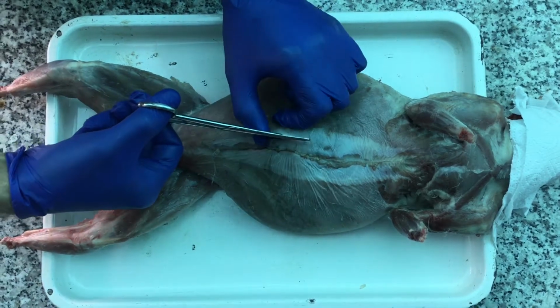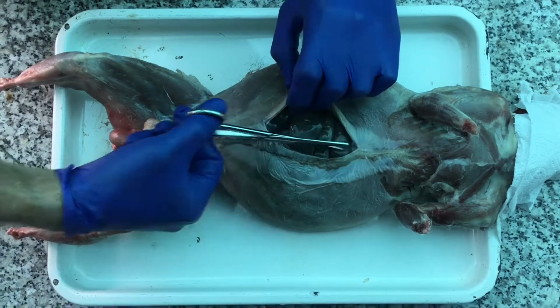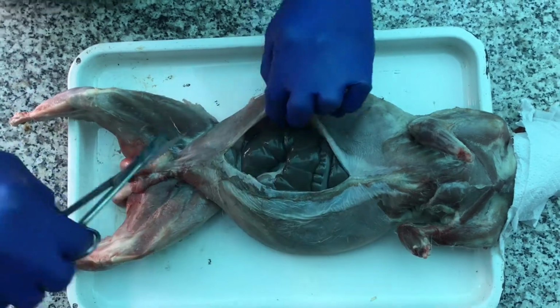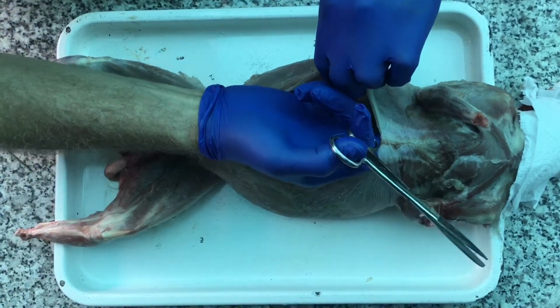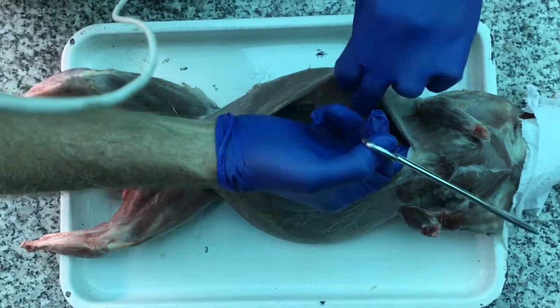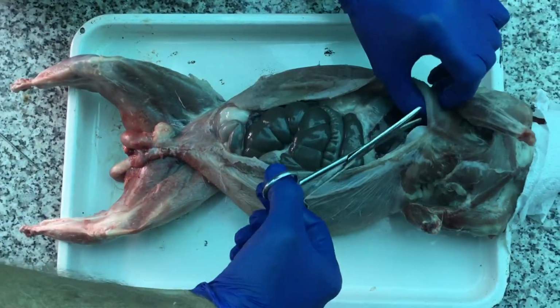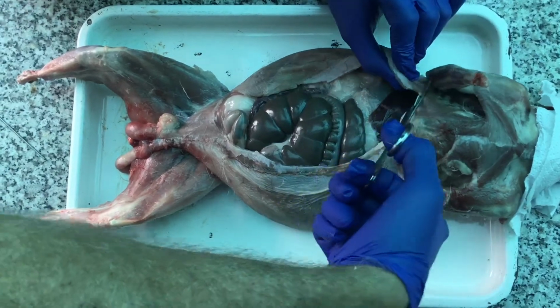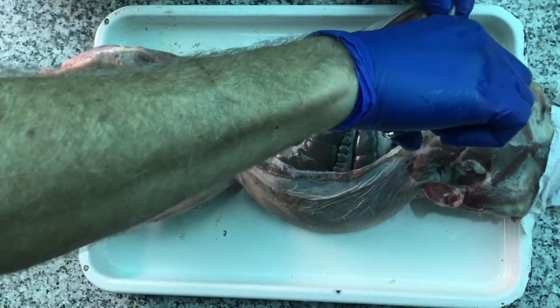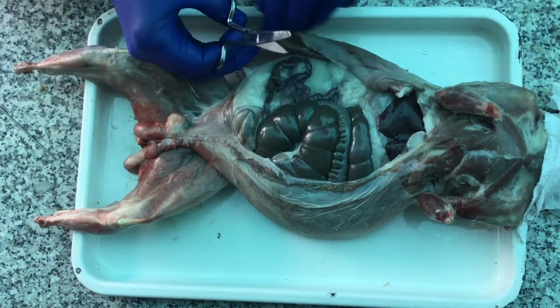And I'm just cutting right through that muscular wall of the abdominal cavity, the oblique and rectus muscles, so that we can open up or get into the coelom. And I'm going to go all the way up. I can feel the diaphragm up there, so I'm just going to cut all the way up to the diaphragm, right up there. And then I'm going to make some flaps so that I can see off to the side all the way around like this. And I'm just cutting down inferior to the ribs here. And this then would be that muscular abdominal wall.